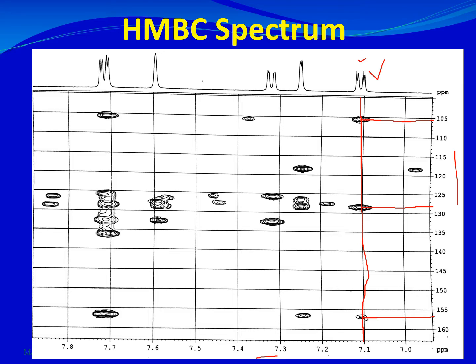These three carbon atoms do not include the carbon directly attached to the 7.1 ppm proton — this is not a one-bond coupling but two-to-three bond couplings. Looking at another proton, drawing a line underneath its signal passes through two contours. This proton resonates at about 7.32 ppm and shows two long-range connectivities: one with the carbon resonating at about 126 ppm and another at about 133 ppm.